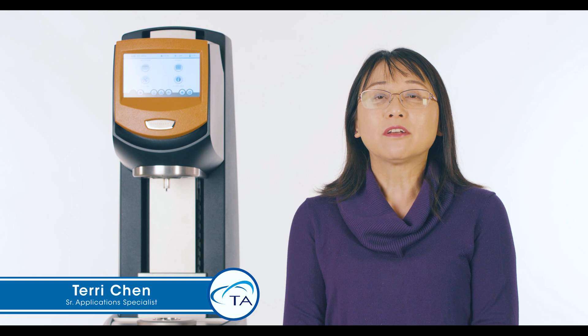Hello, welcome to another TA Tech Tip. Today we will demonstrate proper liquid or soft semi-solid sample loading techniques on a TA Instruments Discovery Hybrid Rheometer.